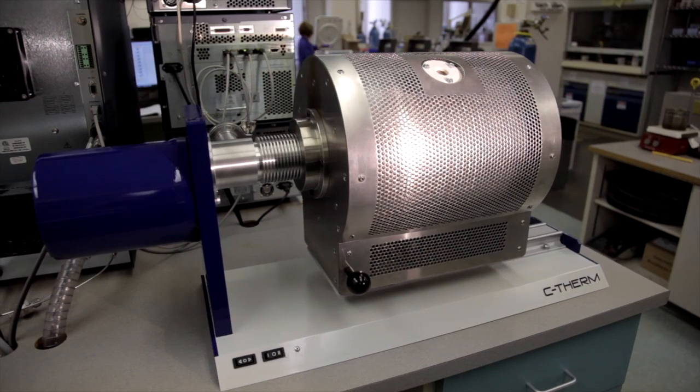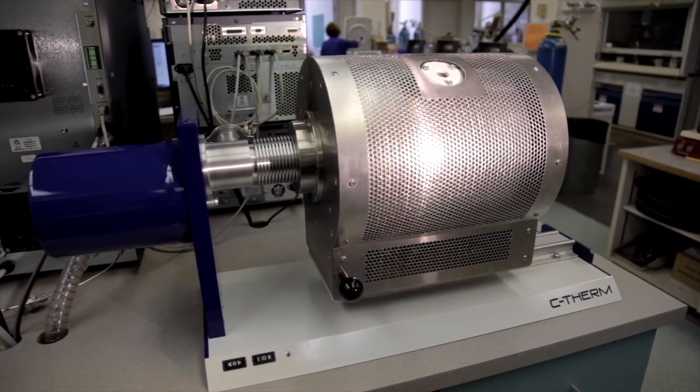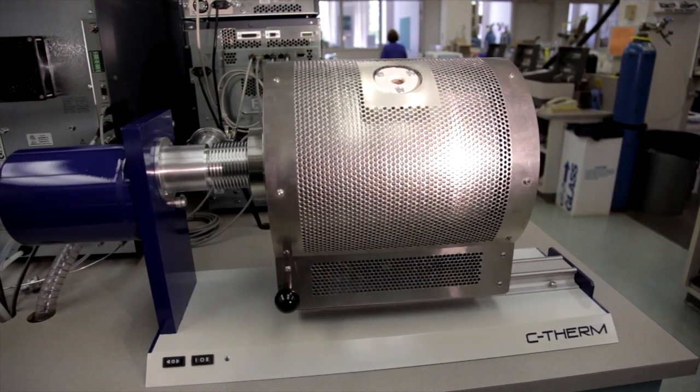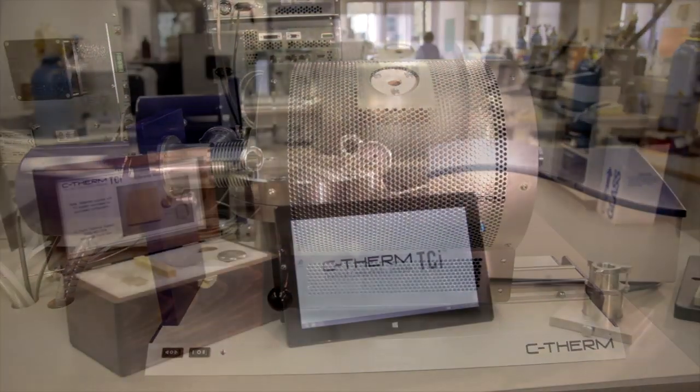The ease of upgrading from single to dual rod and multiple furnace options offer researchers the ability to scale the system to their specific needs while balancing any range of requirements and budget.